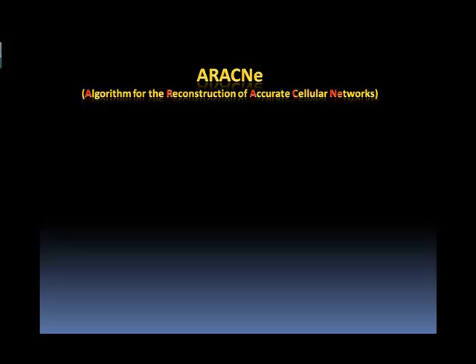Hi, this video is intended to demonstrate how to set up and run the ARACNe component in geWorkbench. First, let's briefly touch base on what ARACNe is and what geWorkbench is.